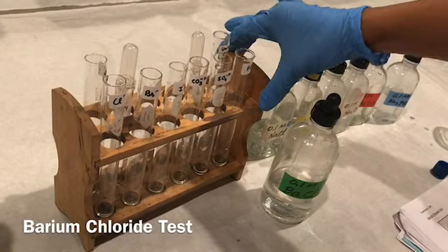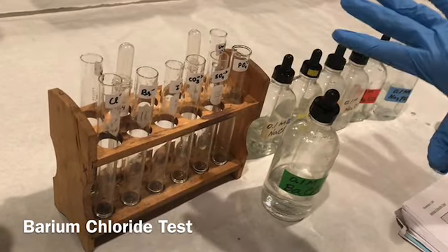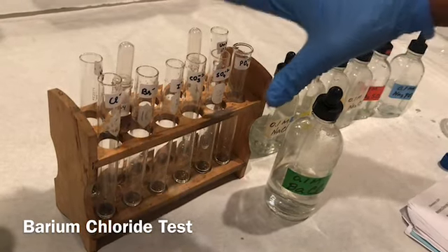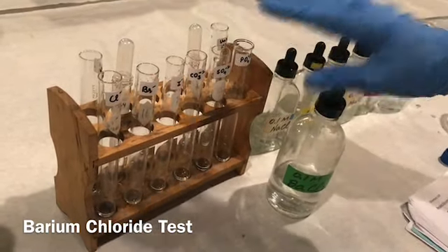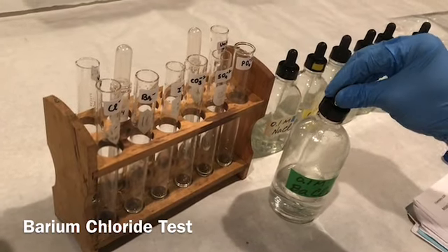Okay, so after the silver nitrate test, I discarded all the solutions and then I rinsed the test tubes with DI water, and they are already ready for the barium chloride test. I already added all the test solutions in the test tubes. Now I am going to add 6 drops of barium chloride in each of the test tubes.